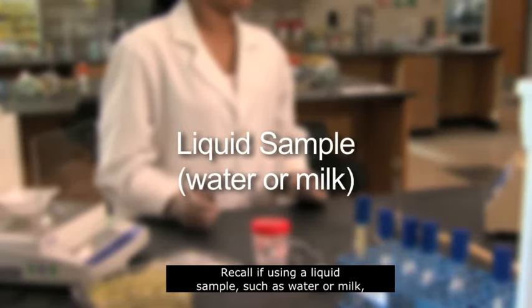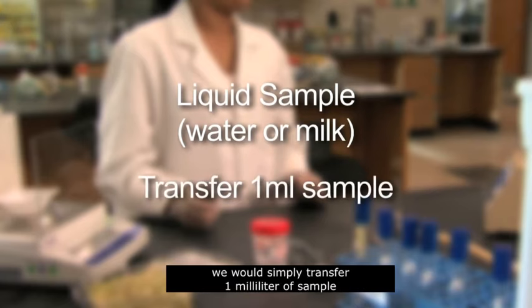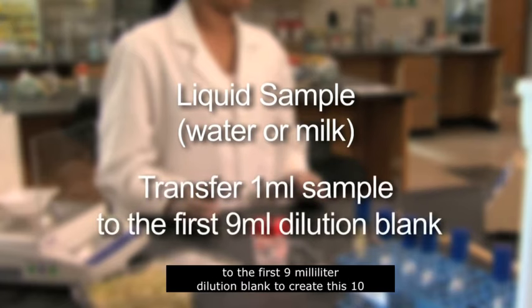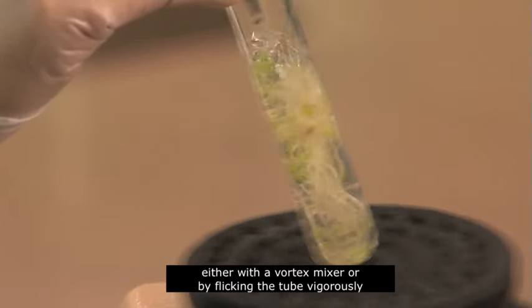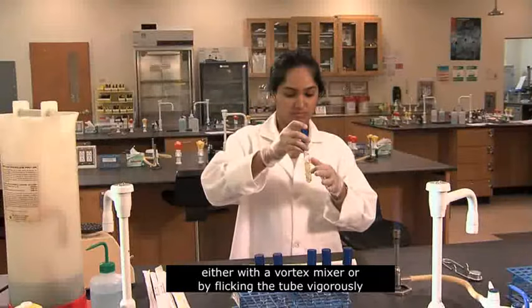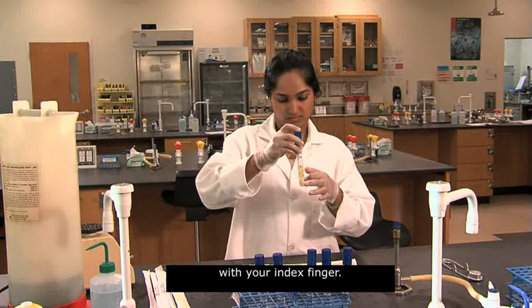Recall, if using a liquid sample such as water or milk, we would simply transfer 1 milliliter of sample to the first 9 milliliter dilution blank to create this 10 to the negative 1 dilution. Hold the tube at an angle and mix the contents, either with a vortex mixer or by flicking the tube vigorously with your index finger.